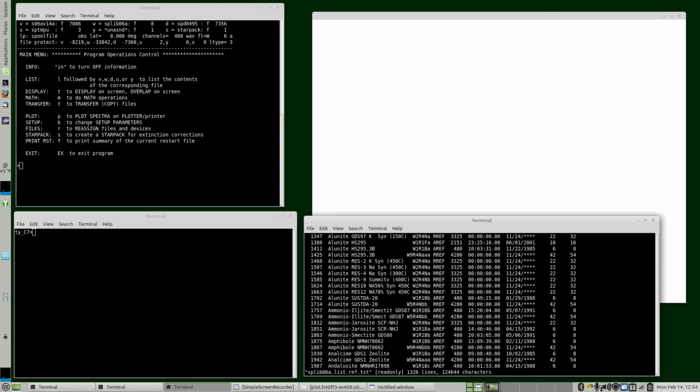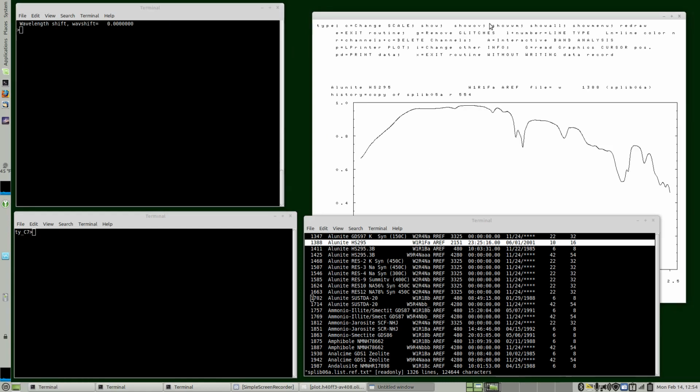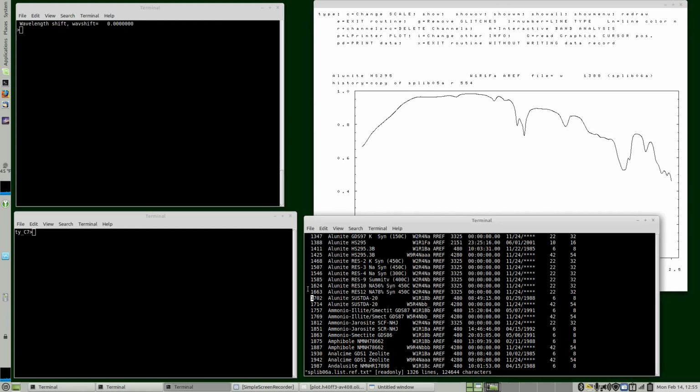So I thought, as an example, we'll plot this spectrum and this spectrum. So first, the spectral library 06 is assigned to W, so W1388, and we see that the wavelengths are W10, so I can type capital W10, or I can just type ampersand, and it gets the wavelengths from the record pointer. So that spectrum looks good. Then the other spectrum, 1702.